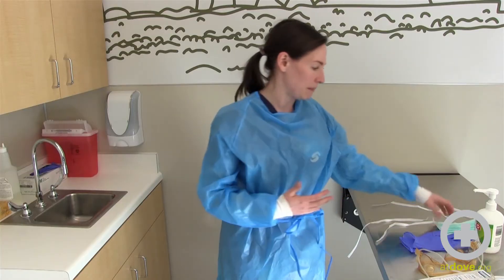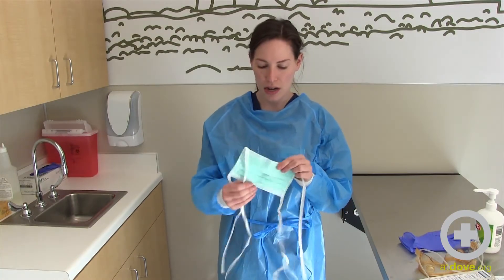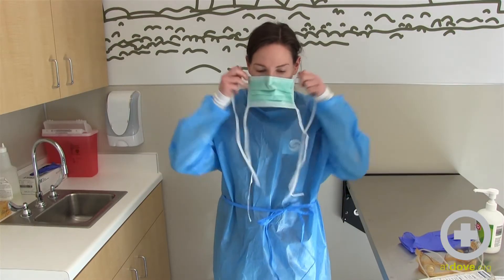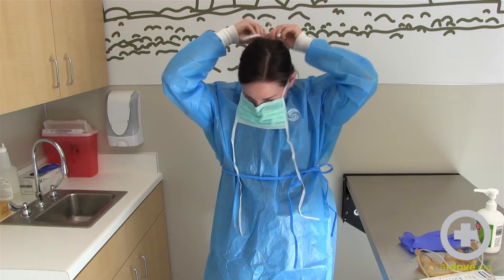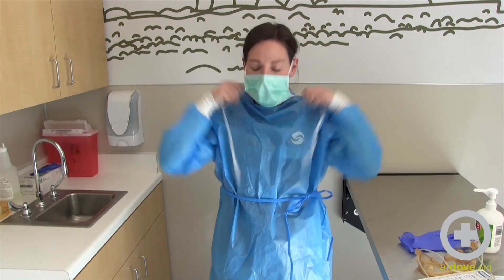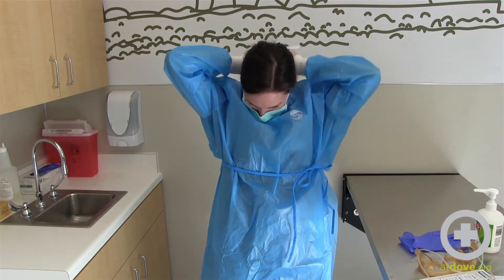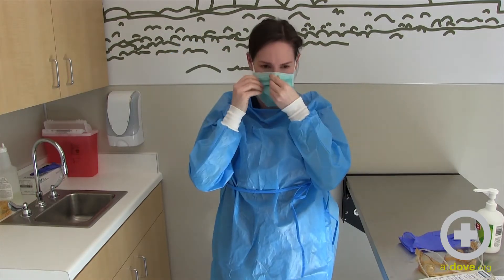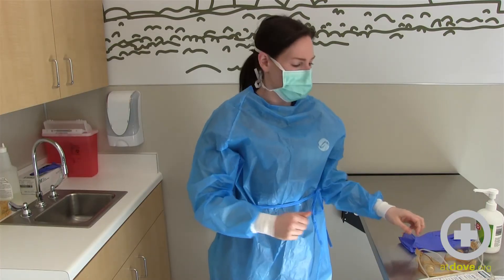The next step is to put your face mask on, so you want to make sure that the outside is outside and you have your little nose bridge part at the top. Make sure to pinch the top of your nose so that it stays up and also keeps any particles out.